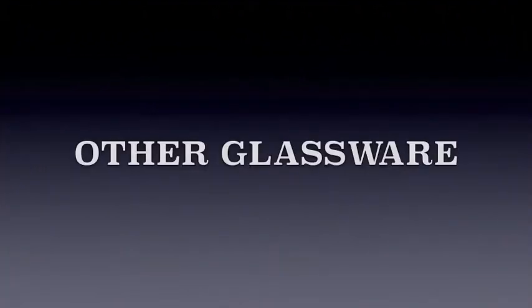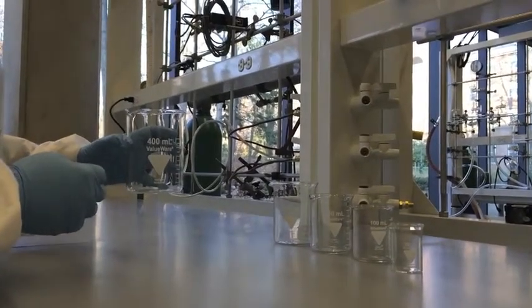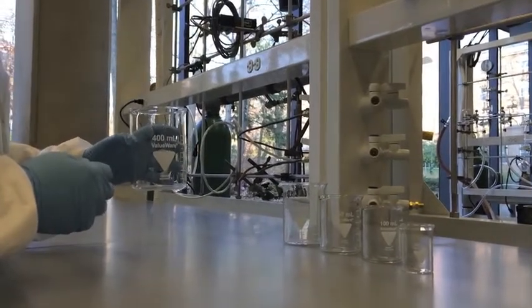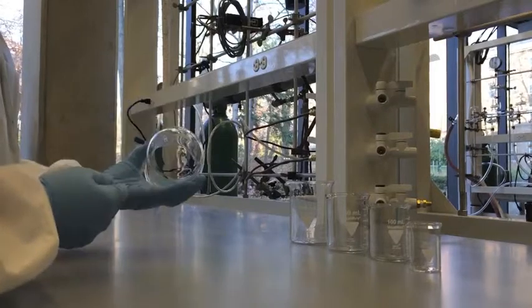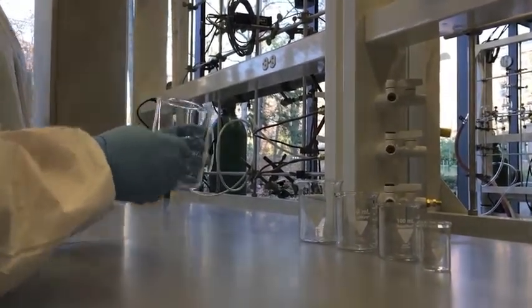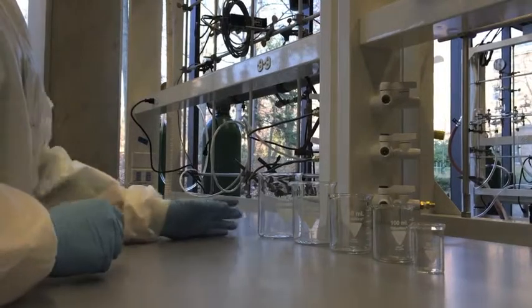Now we're going to talk about other types of glassware. The beaker is a simple container for stirring, mixing, and heating liquids commonly used in many labs. They are generally cylindrically shaped with a flat bottom. Most have a small spout or beak to aid in pouring. Beakers are available in a wide range of sizes, from 1 milliliter up to several liters.